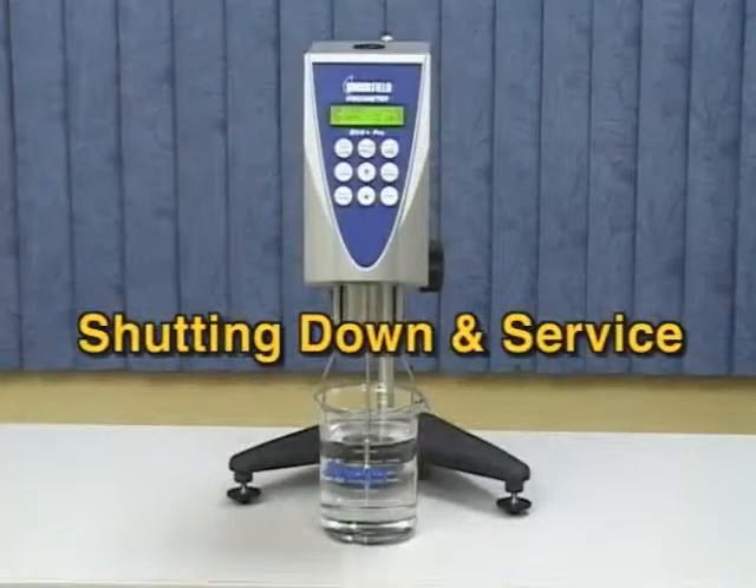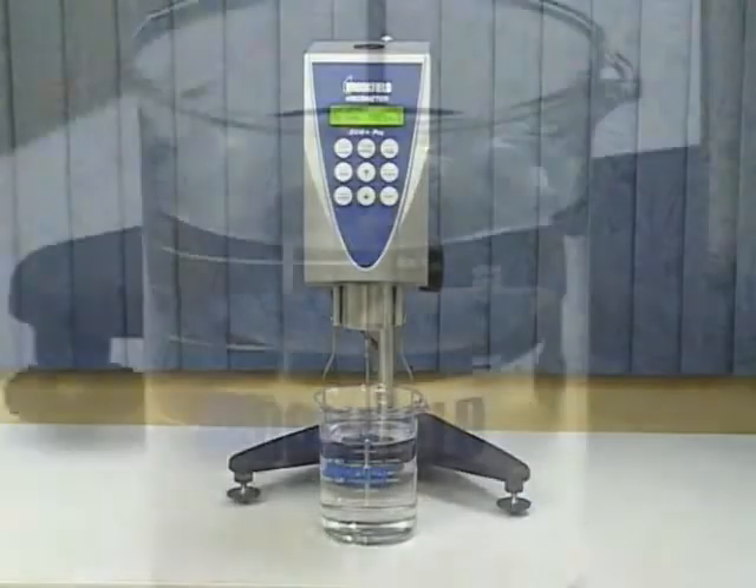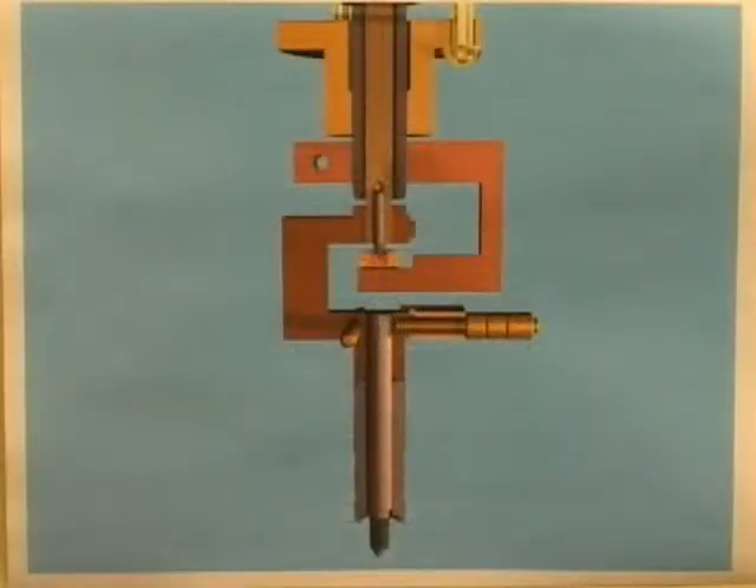Shutting down and servicing your viscometer. Spindles should be removed from the viscometer at the end of a test for cleaning. Brookfield does not recommend that you attempt to clean the spindle while still attached to the viscometer, because damage to the suspension system inside the instrument may result.